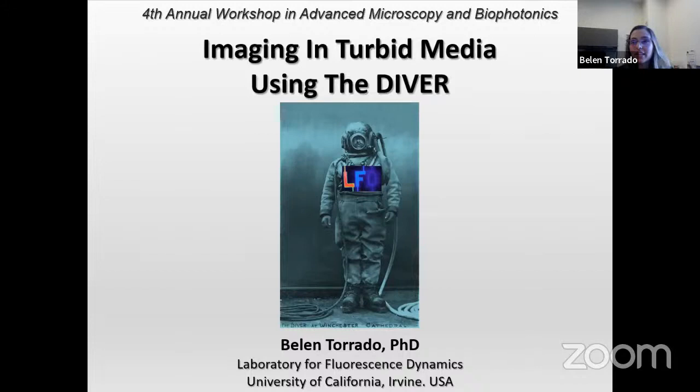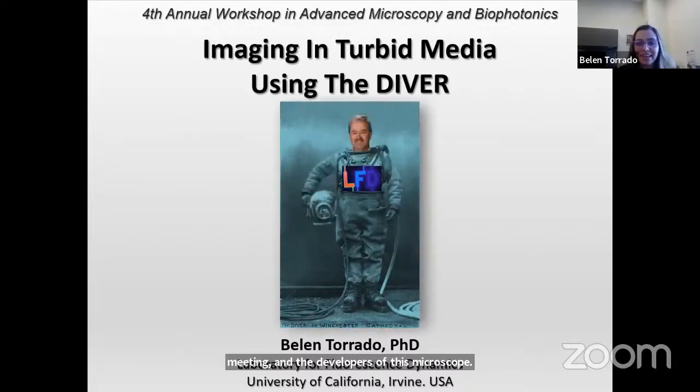And today, as Lionel said, I'm going to talk about the DIVER. The aim to build this microscope was to go deeper, image deeper in turbid media. The developer of this microscope was Sasha, that you can see there, that he retired. And that's why I'm doing this presentation, but I have been his disciple this past year, so it's an honor for me to show you how amazing this microscope is. And as I said, it was a development with Sasha and Enrico and many other people.